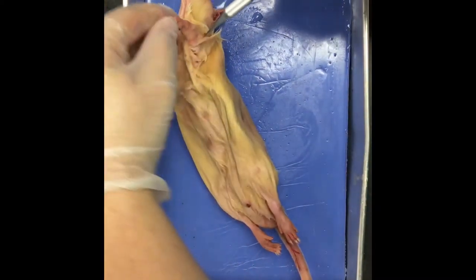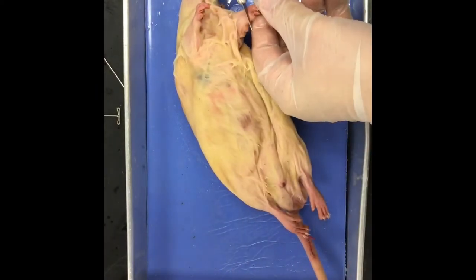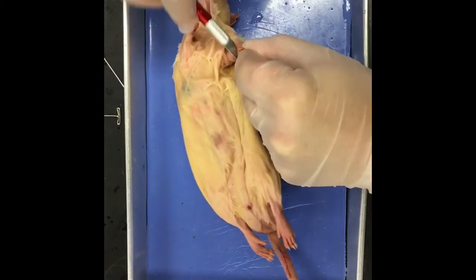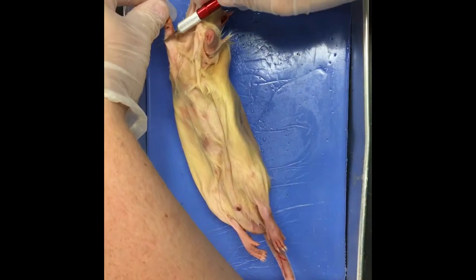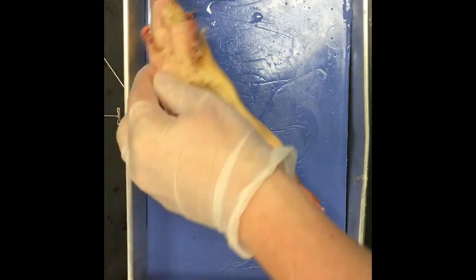So the first step you're going to come through is called cuffing. You're going to cut through the skin surrounding the wrist and ankles. Don't cut yourself. The point of doing that is so that you can peel the skin over and remove the skin entirely.